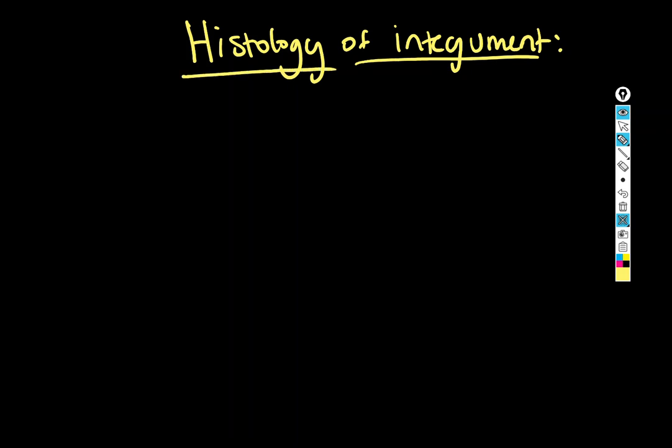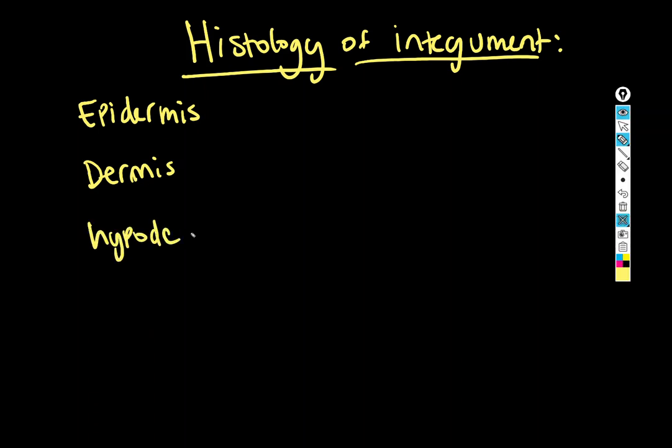So your integumentary system consists of your epidermis and your dermis that cover the outer surface of your body. And so let's write that down. The epidermis is superficial to the dermis. And then below that is the hypodermis, which isn't technically part of the integumentary system. It's actually a connective tissue, but we talk about it when we talk about the integumentary system because there's not really any other time that's appropriate to discuss it. So this list goes from superficial to deep.